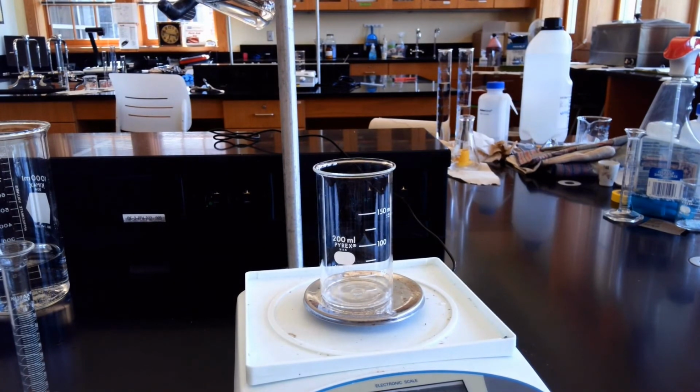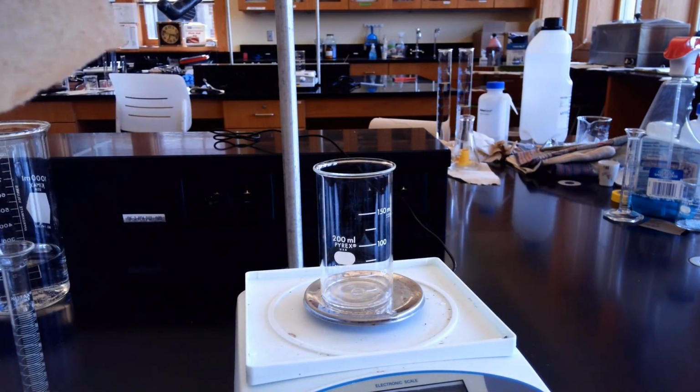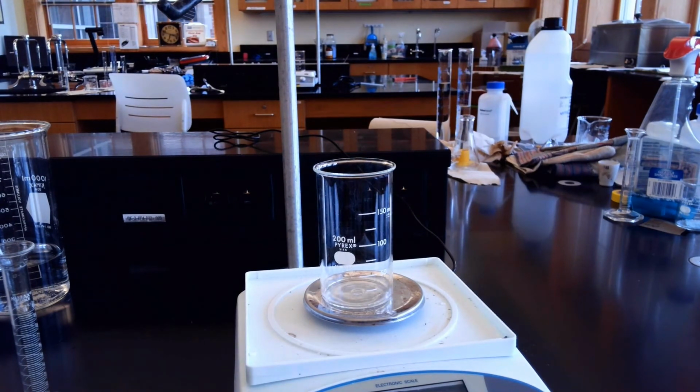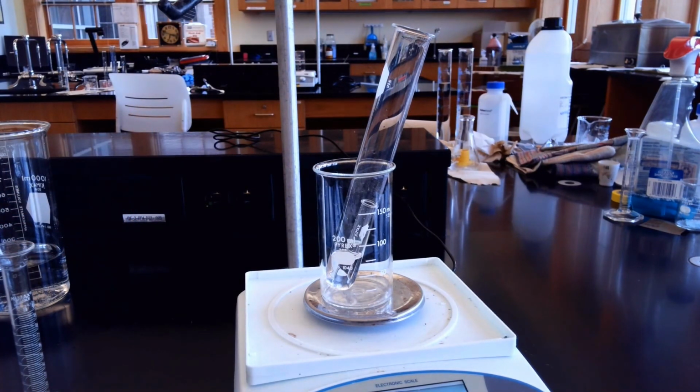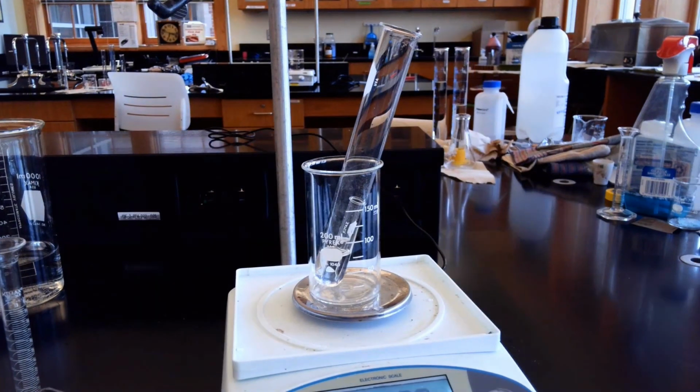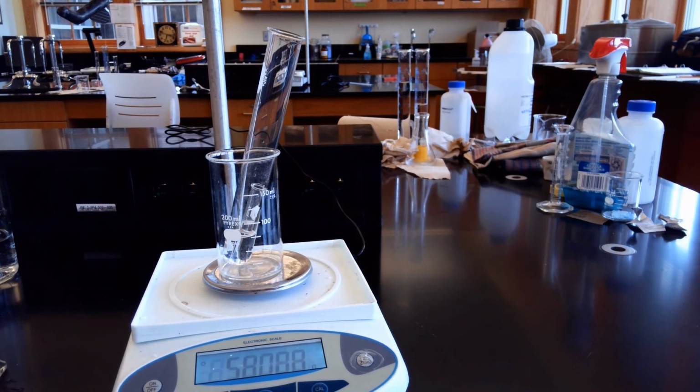I'm going to take some paper towel on this one, and we're going to wipe down the test tube just to make sure it's fully dry. Here with our gloves. Let me wipe the top, and then wipe the bottom, because that's where it was last touching. And let's put it in. And our mass of the generator after is 58.088 grams.